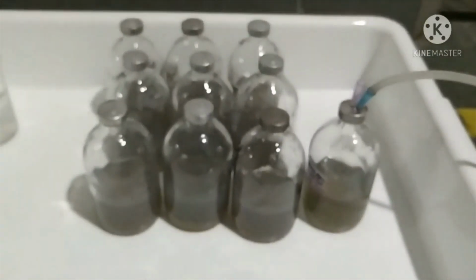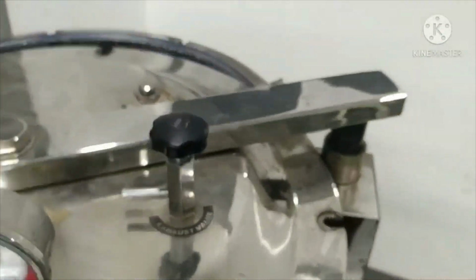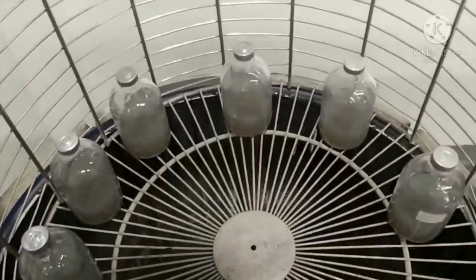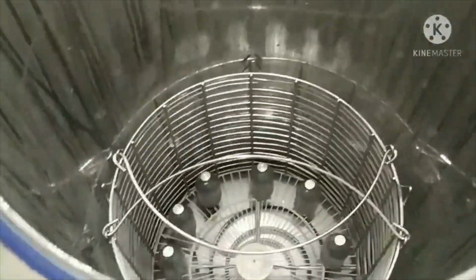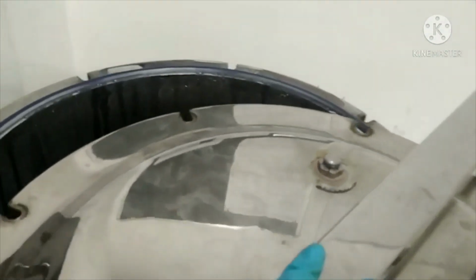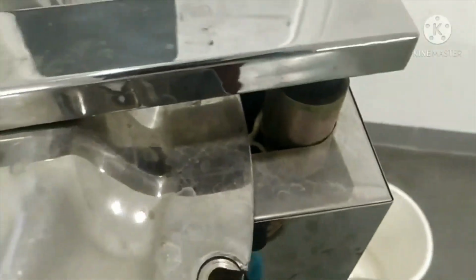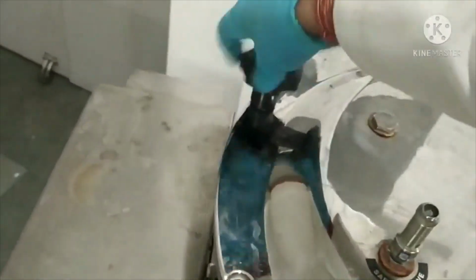After that we will do the autoclaving. Cleaning is over. Now we are removing it.